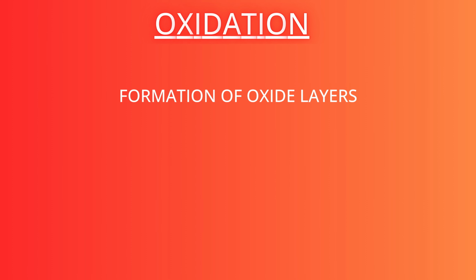So another problem at those elevated temperatures is oxidation. Many materials begin to oxidize quite rapidly at those elevated temperatures, which means that oxide layers form on the surface, and those layers can grow, change, or even crack during the testing.